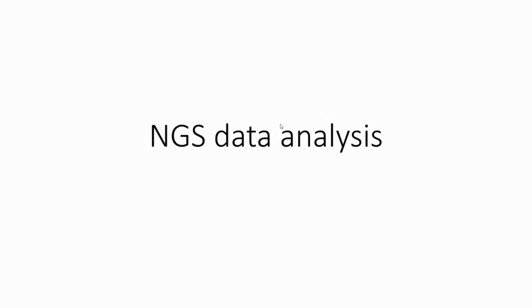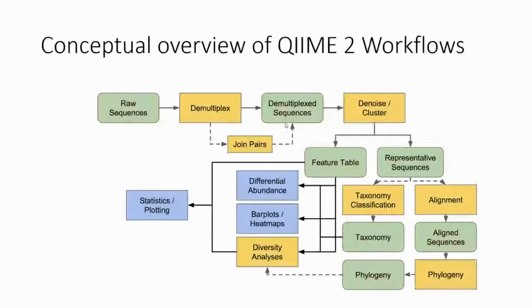Today we will discuss the NGS data analysis. So NGS data analysis is what happens after you see those sequencing data, and then you want to understand what it means.